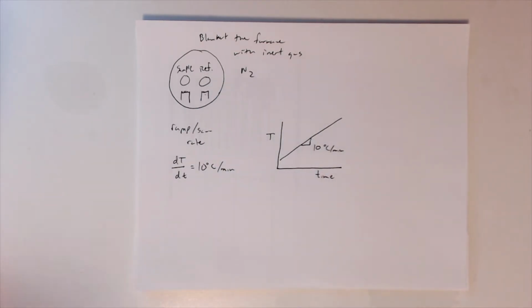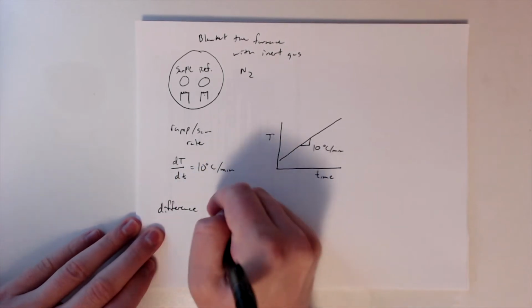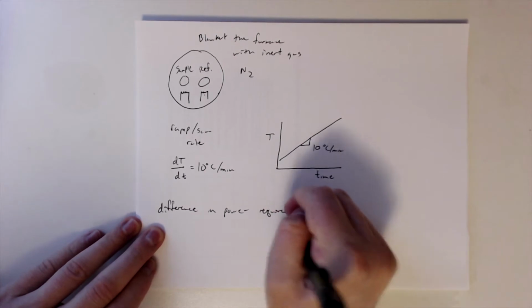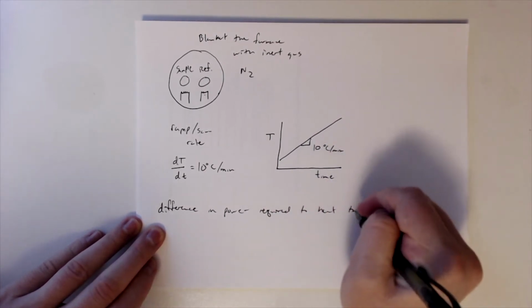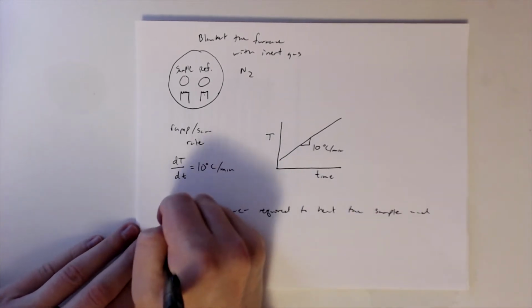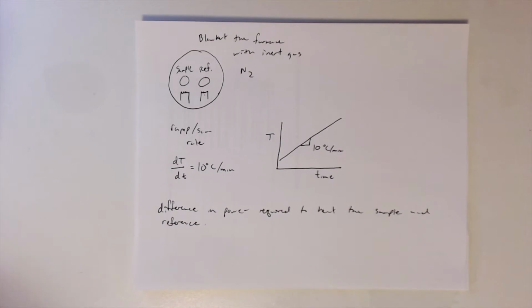And so we're measuring this difference in power required to heat the samples. So that's something that we measure.